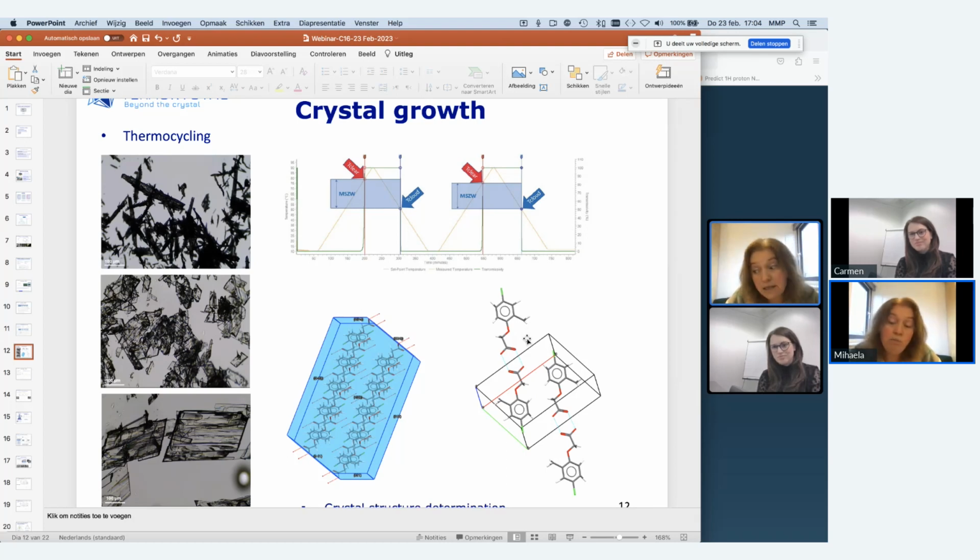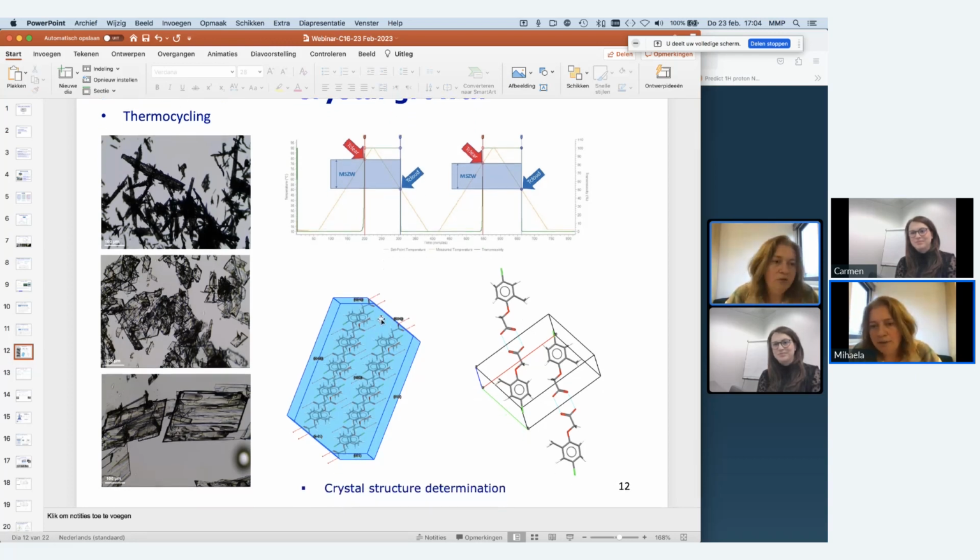But that's an important part, and in many cases, especially with very flexible molecules or crystals which are not so beautiful, you will need an additional method. Another method that we use in complicated cases, when you have, I don't know how many nitrogens and solid state NMR will not give you the answer, is XPS, X-ray photoelectron spectroscopy, on the surface, and there you can determine that as well. So there are possibilities. Please come to me if you have challenging cases.